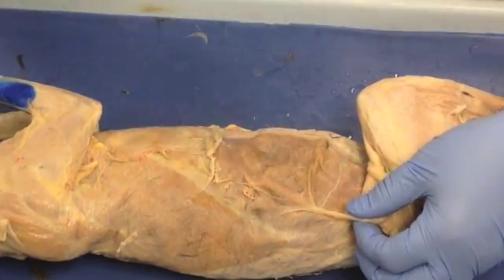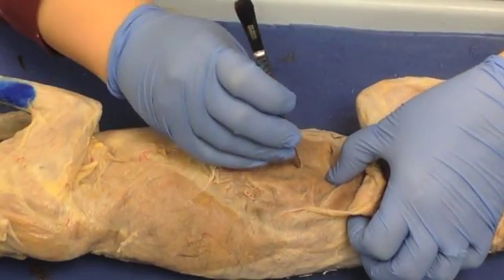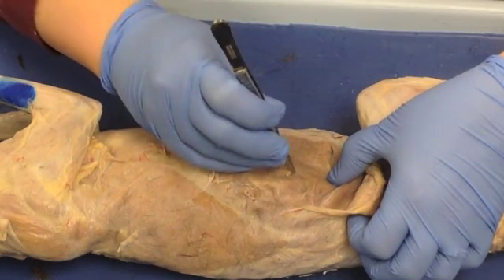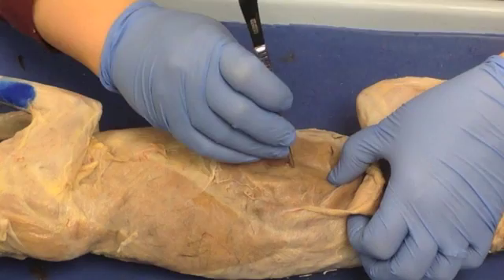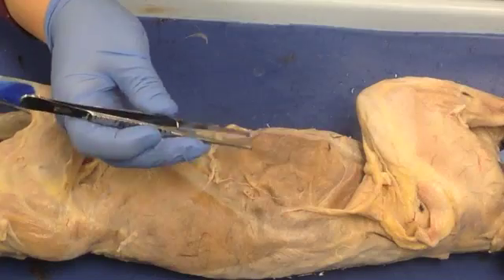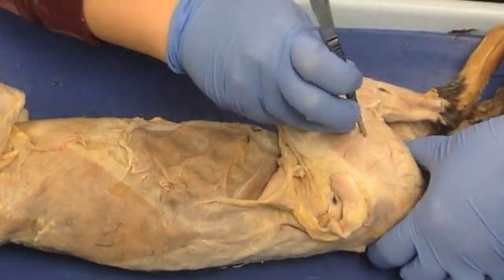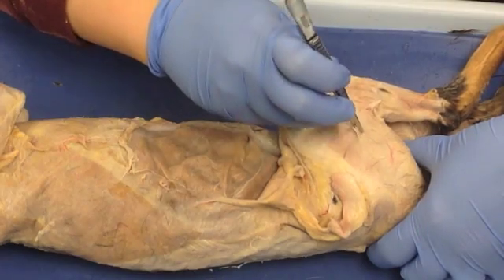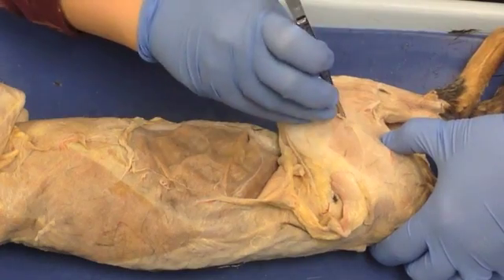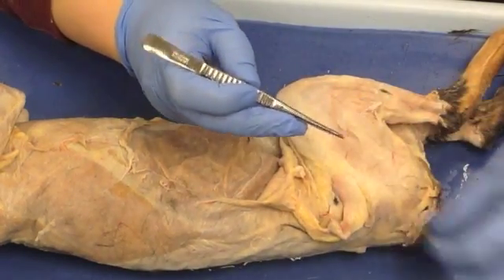Some muscles will have more connective tissue on them than others. For example, here we're looking at the external obliques, and you can see there's just some very fine, wispy connective tissue that you don't really have to worry about. Then you've got other muscles, like down here with semimembranosus, which have more connective tissue that you will want to remove.